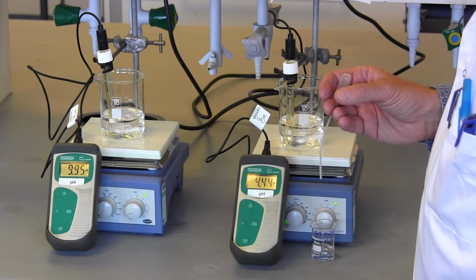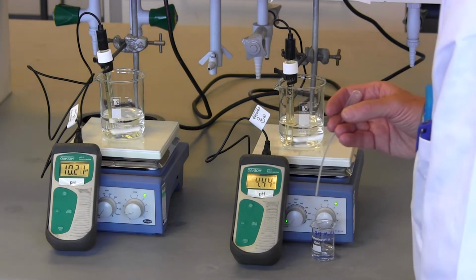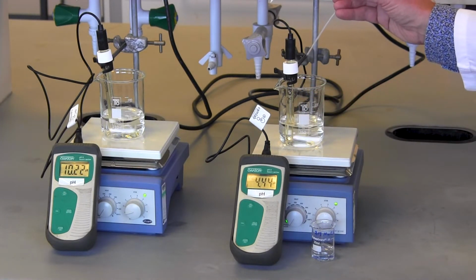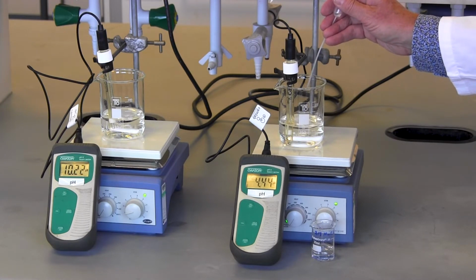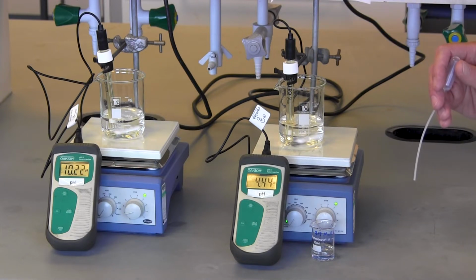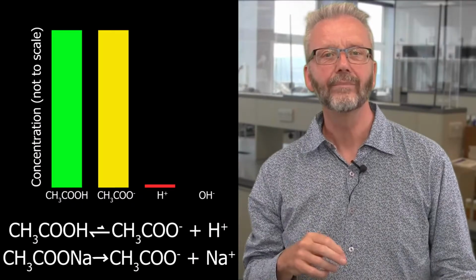The pH changes very markedly. I'm also going to add 1 drop of 2 molar sodium hydroxide to our buffer system. And it doesn't change at all.